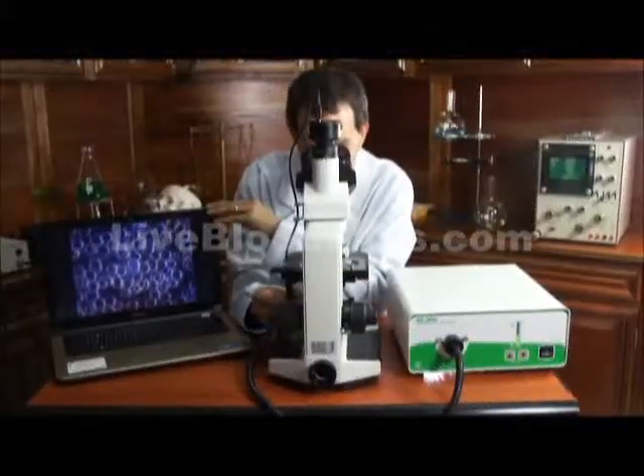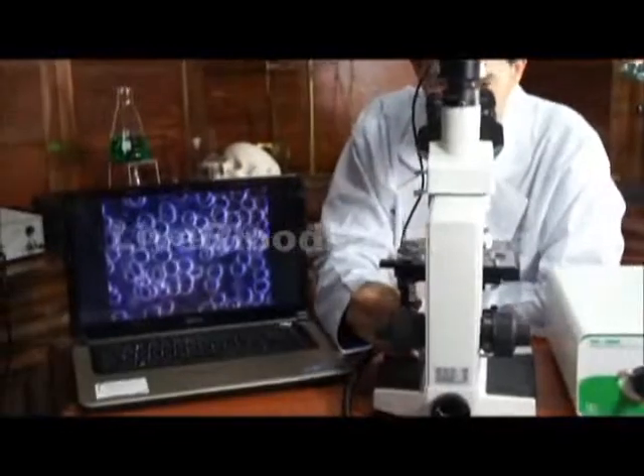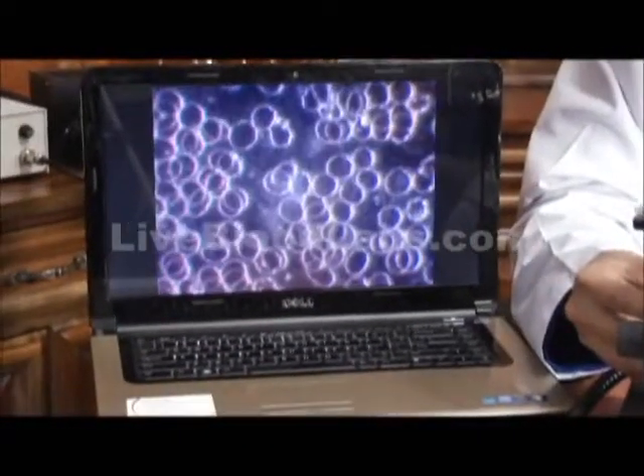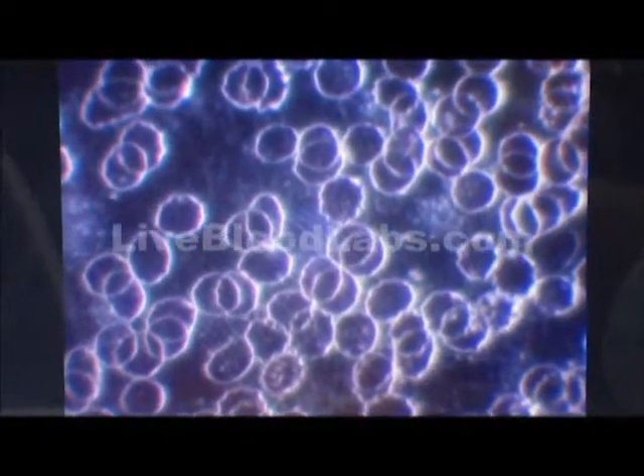Do an image through the camera. You can scan the image, scan the slide, looking at the different features. You can also use the fine focusing knob and do your analysis of the blood.